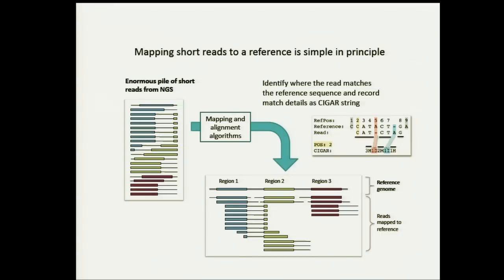Yes? What does Cigar mean? What the Cigar means? I have no idea. Does anybody know what Cigar means? Something about compact gapped alignment format. You guys should ask Bob Handsaker this afternoon. He was one of the creators of the spec. All right, so ask Bob this afternoon. I really don't know what it means, but I know what it does.